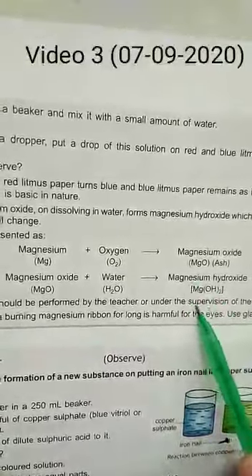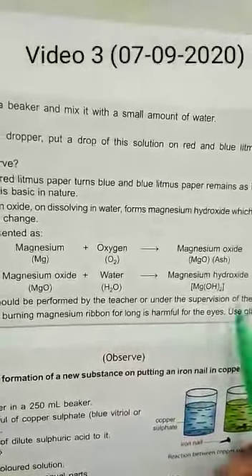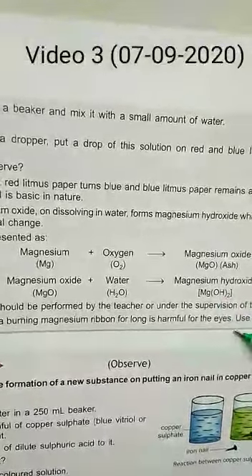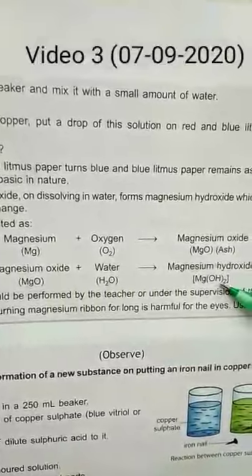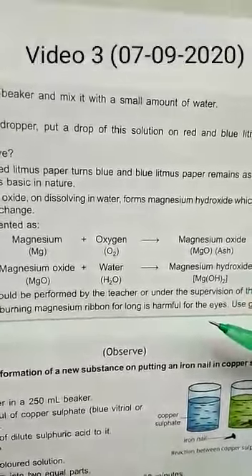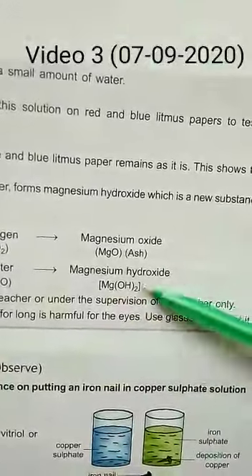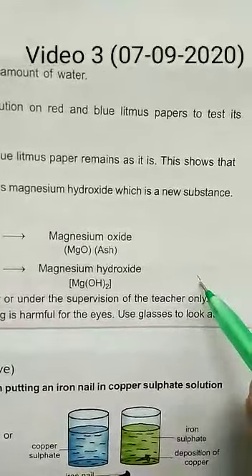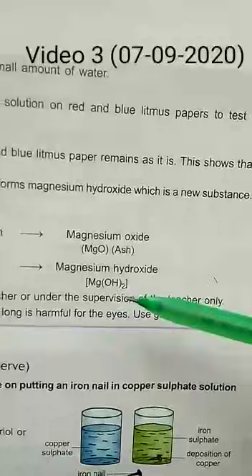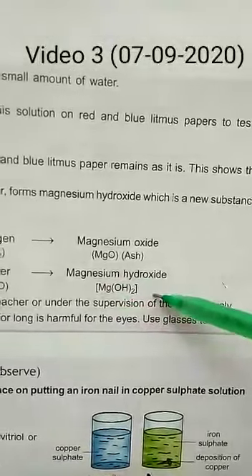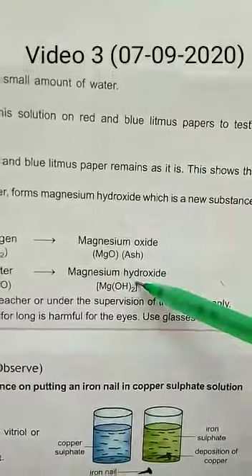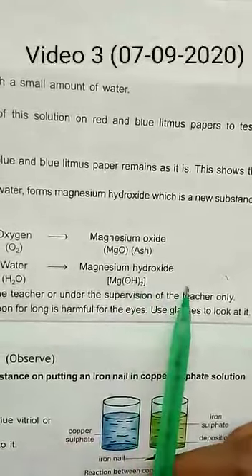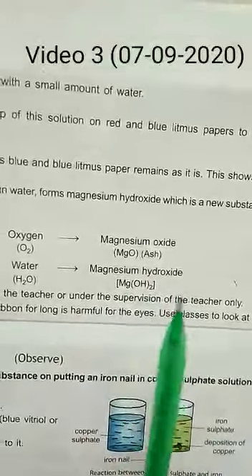Now we check whether magnesium hydroxide is acidic or basic in nature using litmus paper. If it is basic, it will turn red litmus to blue. If it is acidic, it will turn blue litmus to red. On putting the litmus paper into this solution, we observe red litmus turns blue — so Mg(OH)₂ is basic in nature.